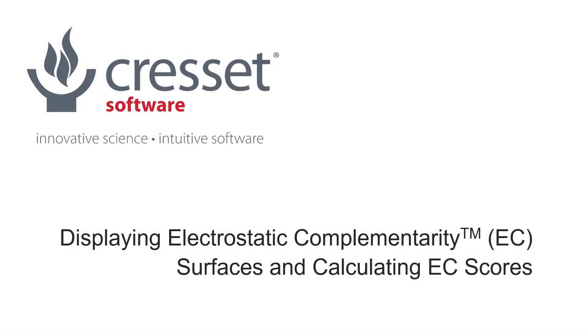In this video I'm going to demonstrate how to plot electrostatic complementarity or EC maps for proteins and ligands in FLIR and calculate EC scores for protein ligand complexes.